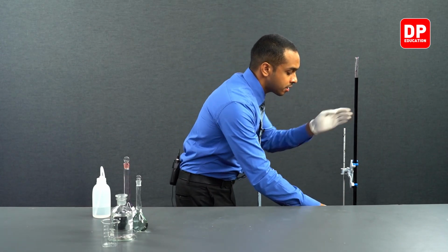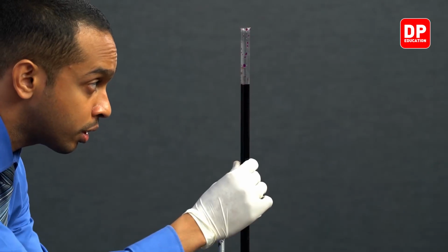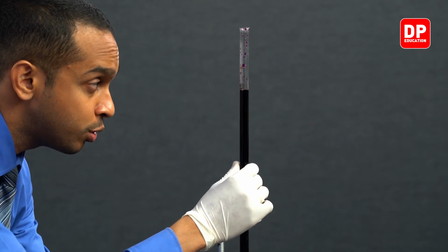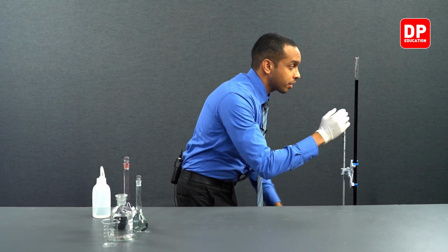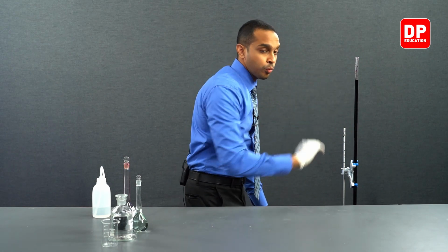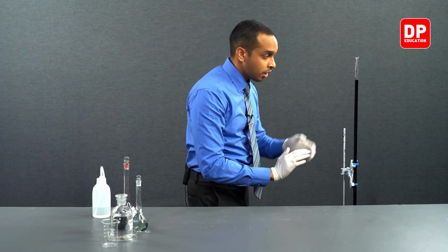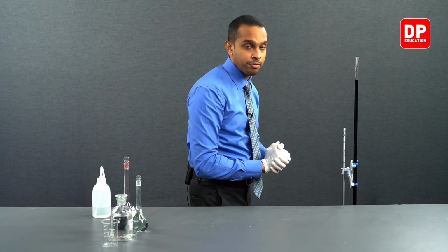So let's open the tap of the burette and bring the solution line down to the zero line. And please notice that I try my best to keep my eye level with the level of the meniscus. This is done to make sure that the meniscus and the zero line are aligning perfectly.